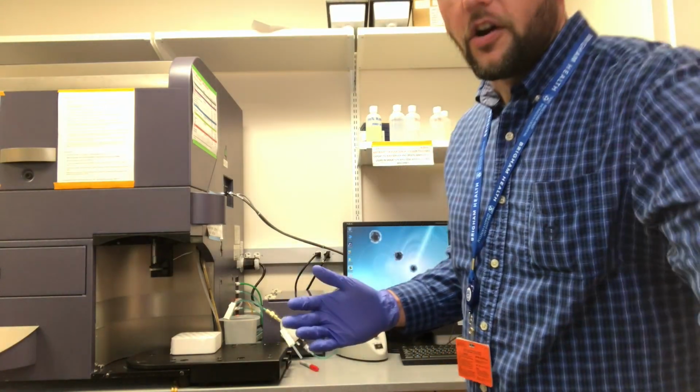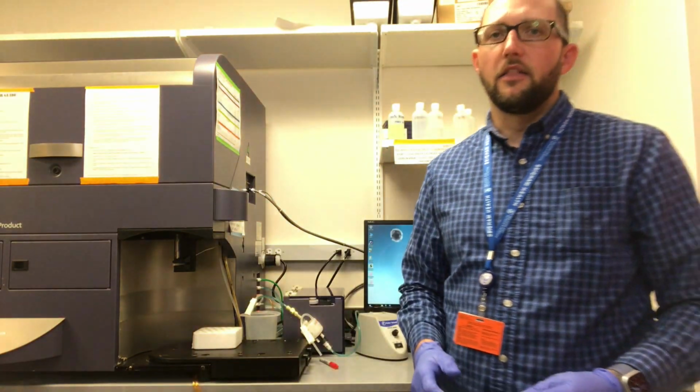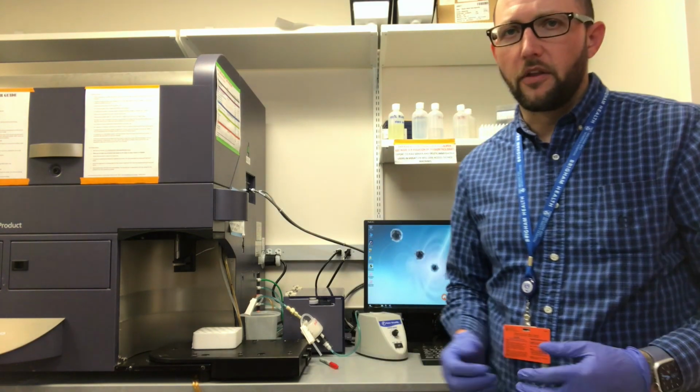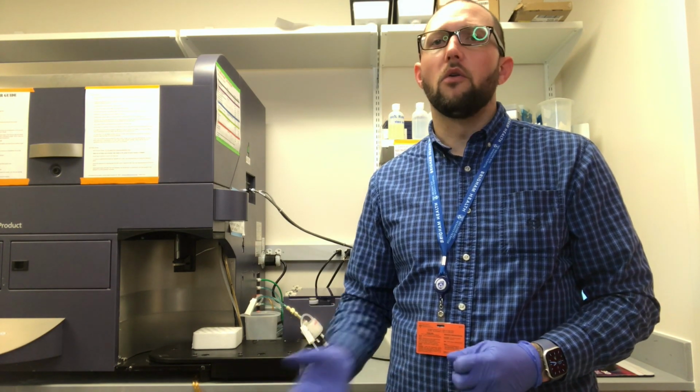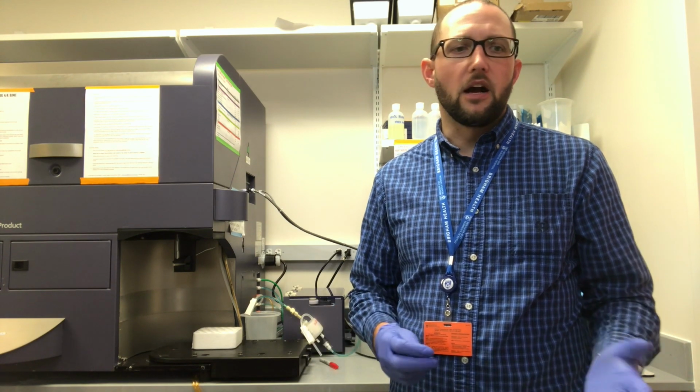First off, we ask all of our users to please sign in on our sign-in sheets. They go over general information about the user, your lab, the time that you're using the machine, and then friendly reminders to clean your area, to fill and empty the respective tanks that we're going to use, and whether or not you've left the machine shut down overnight or for the next user, and any comments that you ran into while you were running if they're deemed worthy of commenting. And please also note, if they're deemed worthy of commenting, that you also follow that up with a message to myself.